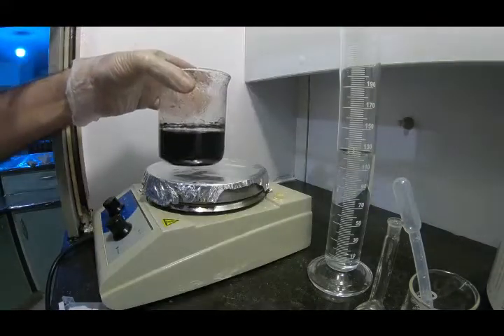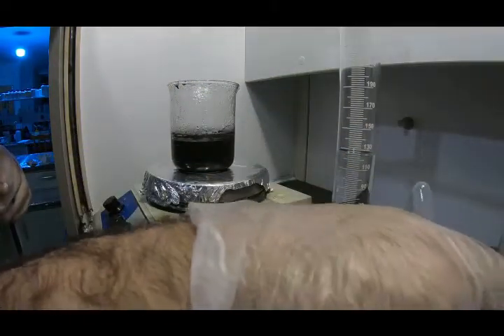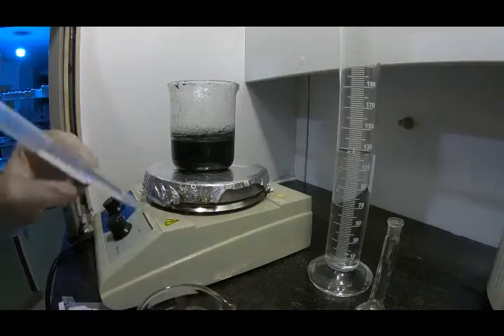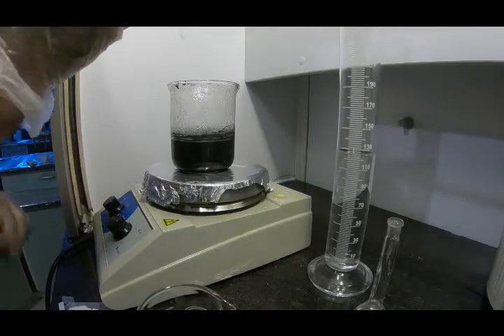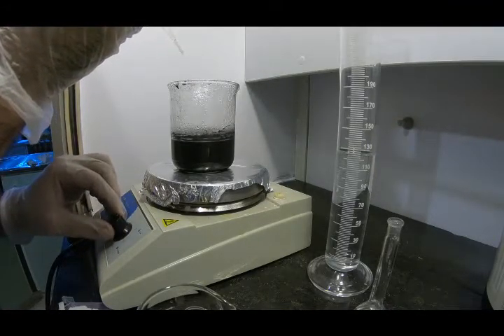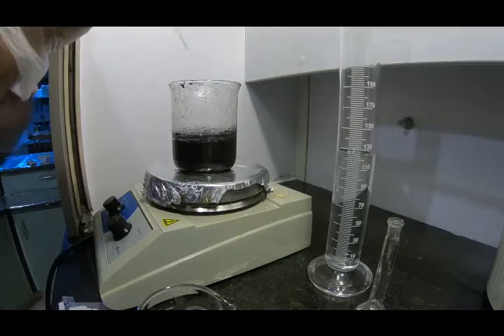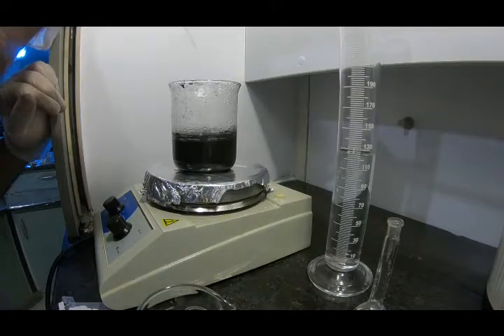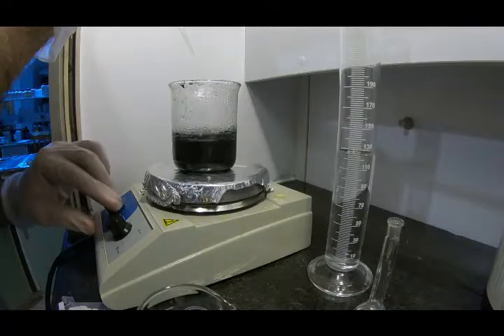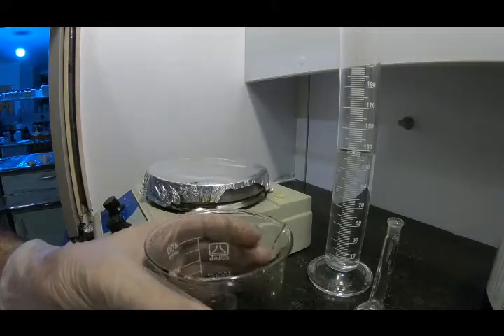Okay, so you need to put it right here, stir it, and add a little bit more. It should be only slightly alkaline. So I'm going to add a little bit more, just a few drops, not much. Okay, now I will check it again.